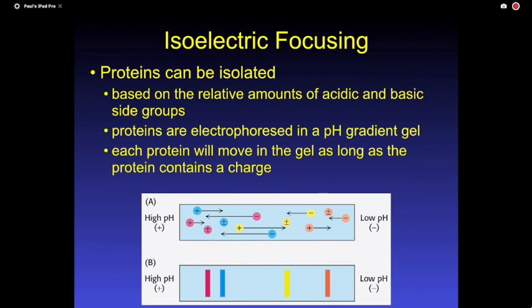But as they migrate, they move into different pH ranges. And remember, as it goes into different pH ranges, each R group and each place that can have a pKa starts to protonate and deprotonate, protonate and deprotonate, until you reach a point at which the protein will not move anymore. Why will it not move? It becomes neutral. What is that state called? I've reached the protein's what? P what? Yeah. Pi.